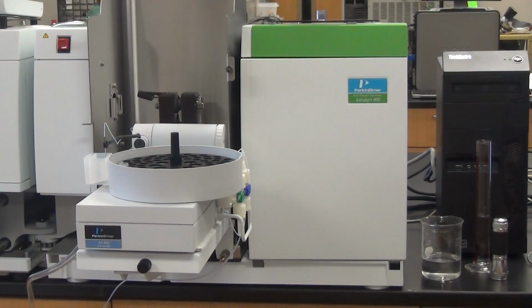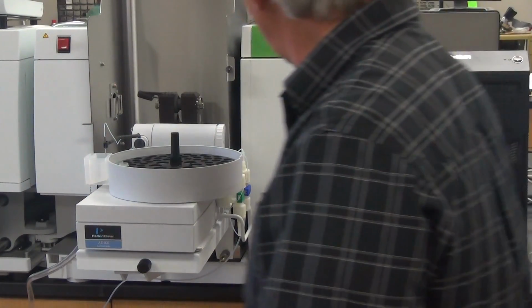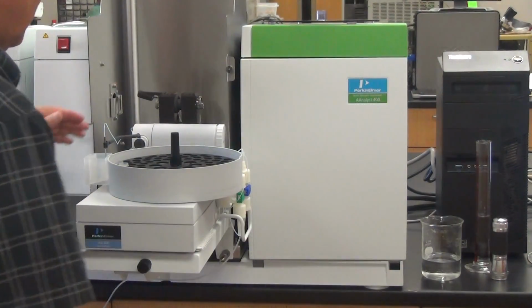It's just like, we saw it, just turn off the background. Well, I don't really want the background clicked on when I'm aligning in front of something. Now, it will show me both the peaks, but the numbers will be skewed because it's automatically subtracting. I could set it for minimum, but you don't want to do it with that.